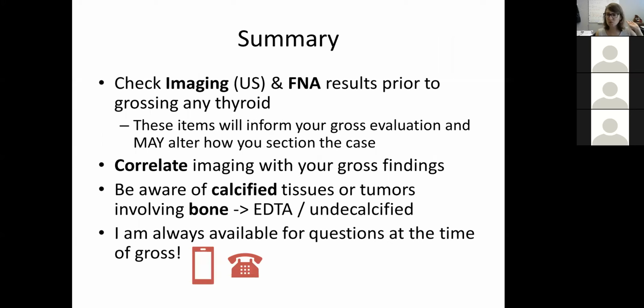Okay. So in summary, when you're grossing those thyroids, always check your imaging and your FNA results prior to grossing. These items will inform your gross evaluation and may alter your sectioning. Correlate the imaging with the gross findings. Beware of those calcified tissues or tumors involving bone.